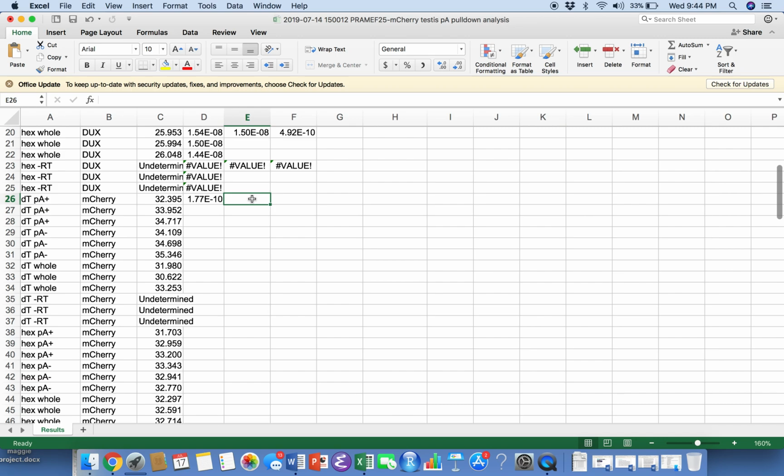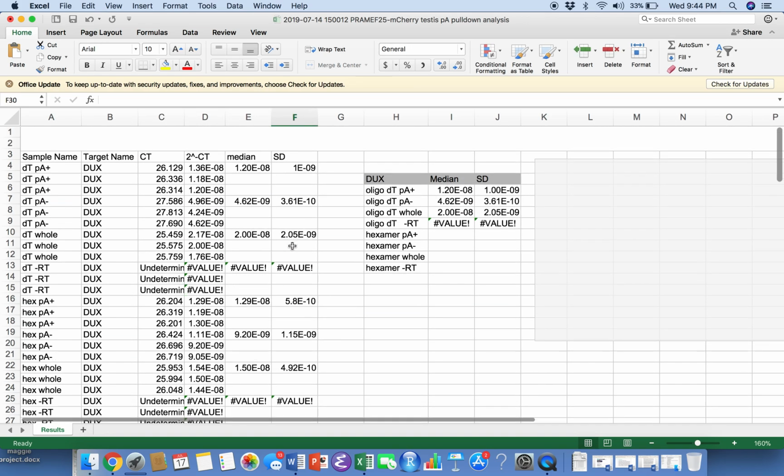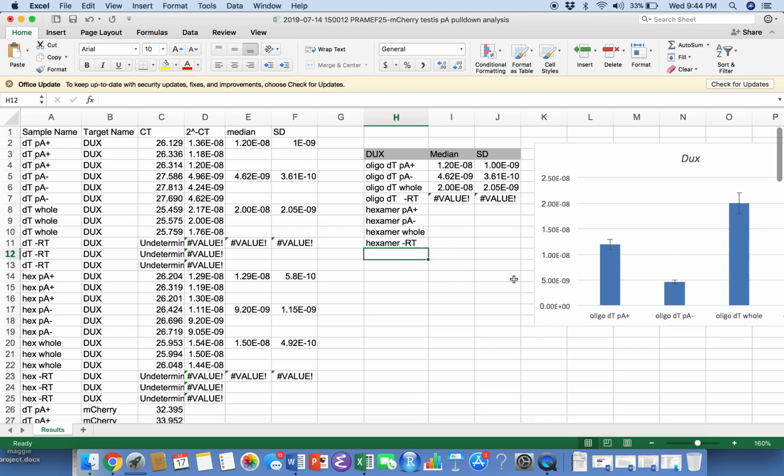But yeah, so fight with this a little bit. See if you get a better understanding. If you don't get all the graphs beautiful, that's fine. But I think it would be good for you to just at least look at how we process data.